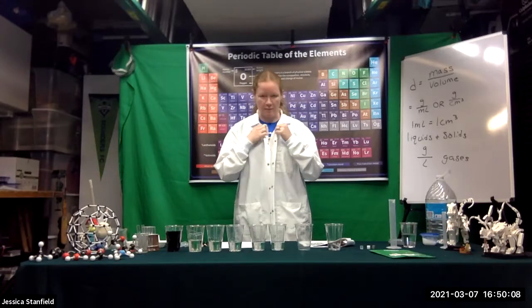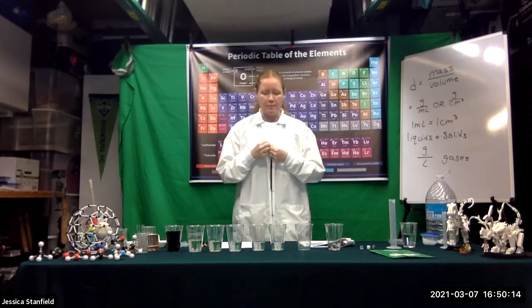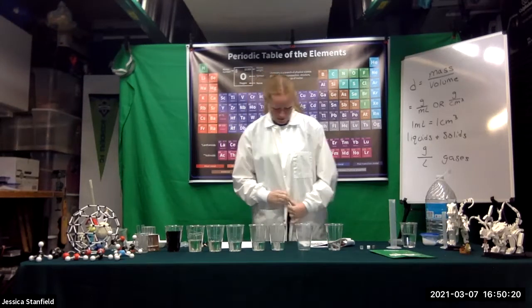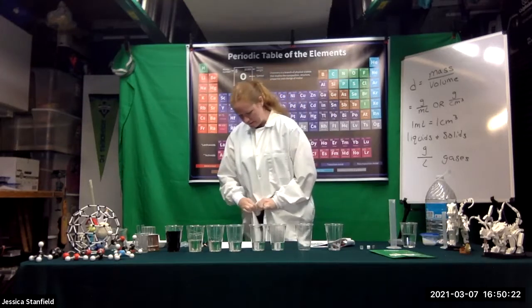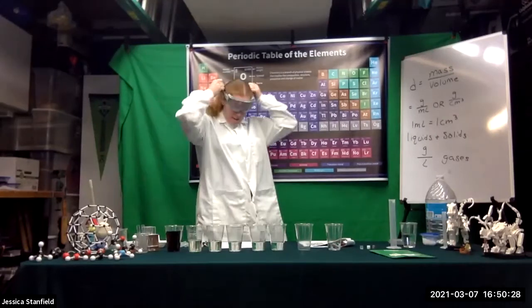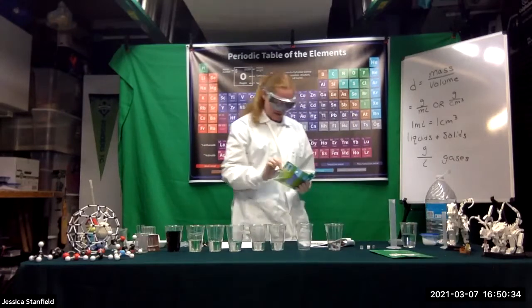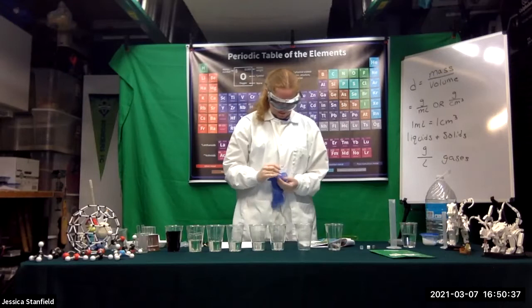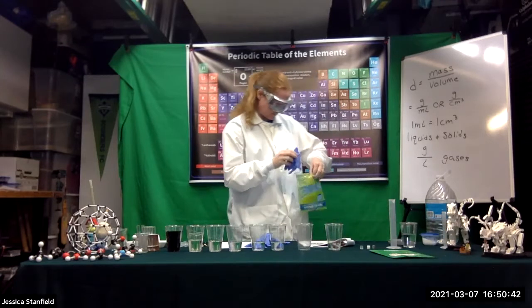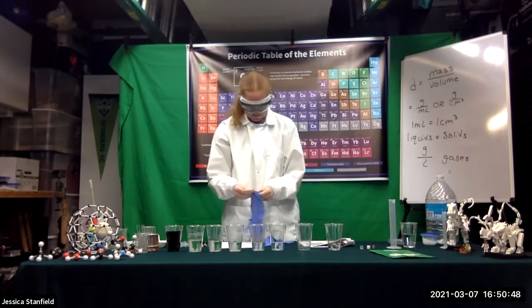So before I do any more lab work, I need to get my PPE sorted again. So I'm going to go ahead and snap up my lab coat because mine snaps. Okay, and then once I'm done snapping up my lab coat, we'll go ahead and grab my goggles, and I will put those on. And then I will get a pair of gloves out. Okay, there's a pair. Then I will be able to work on my experiment.